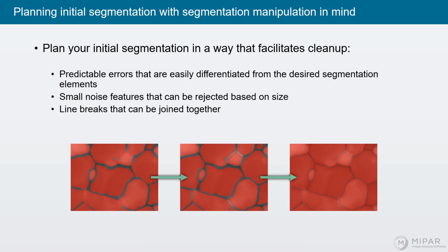And here's an example of that happening using what's known as a watershed algorithm to cut these lines apart. Here, here, here, cut all these, and then using a cleanup step to shrink all these boundaries to 1 pixel wide. So now this represents this entire grain.